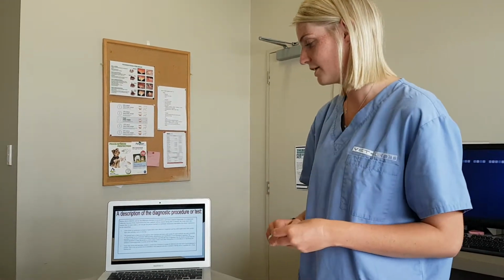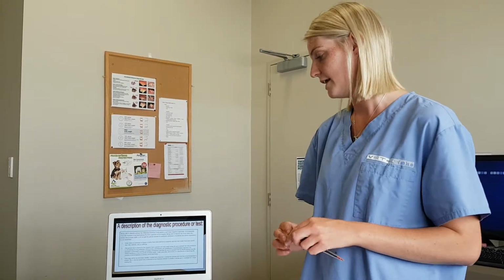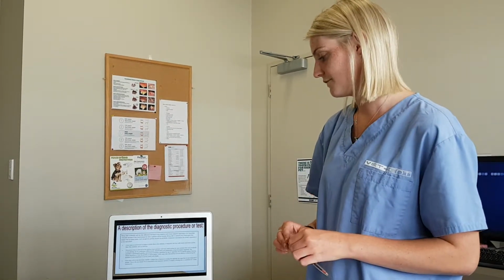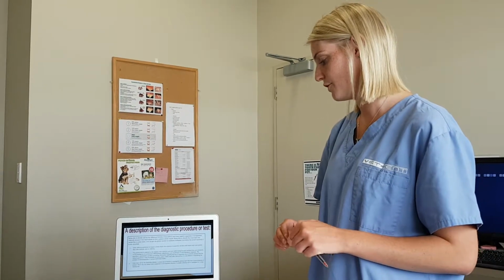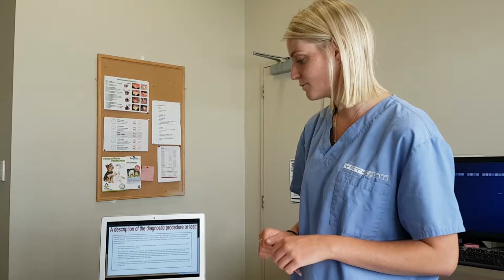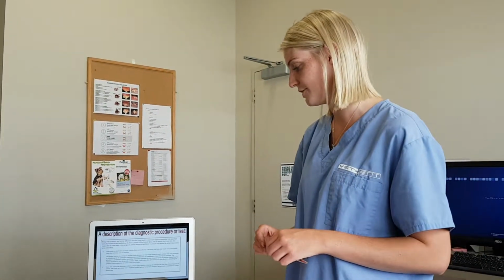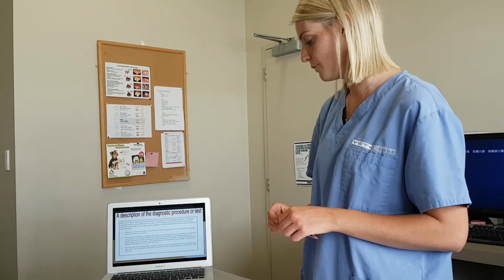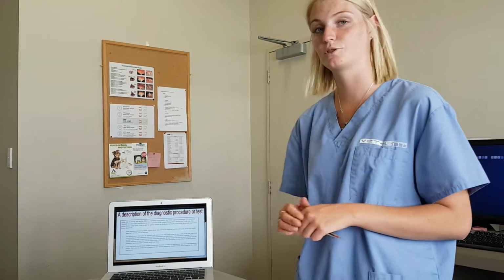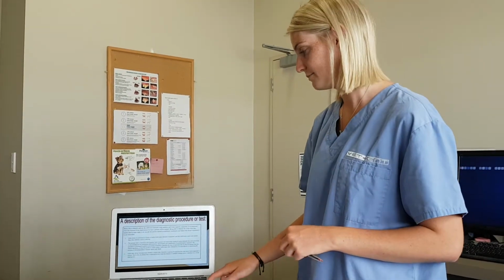So gram staining will let the vets determine whether a certain type of bacteria is causing the infection and what type of microorganism is present. This is why any animal who is suspected to have a bacterial infection, or actually is having one, should definitely be a candidate for a gram stain in clinic.